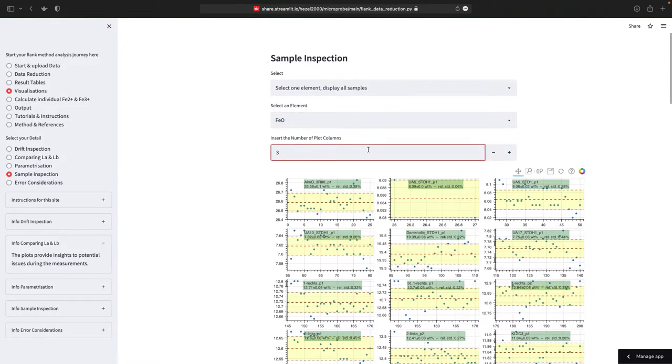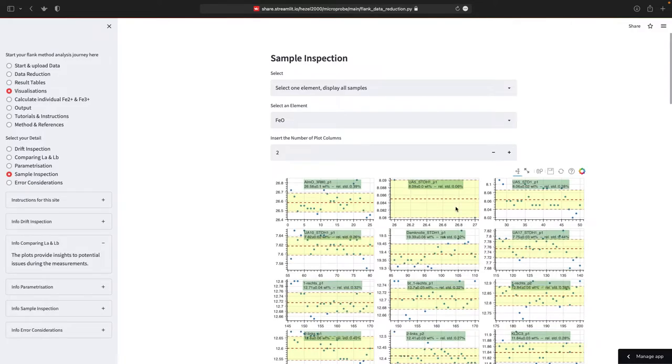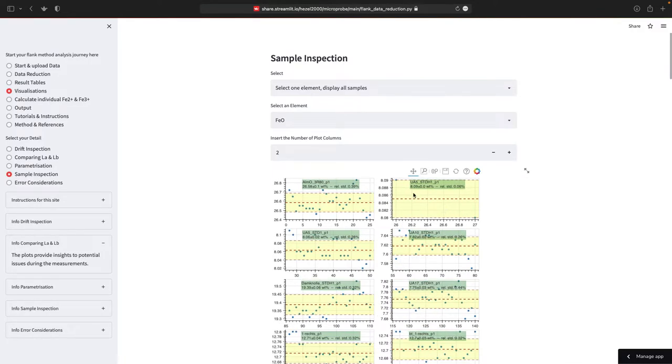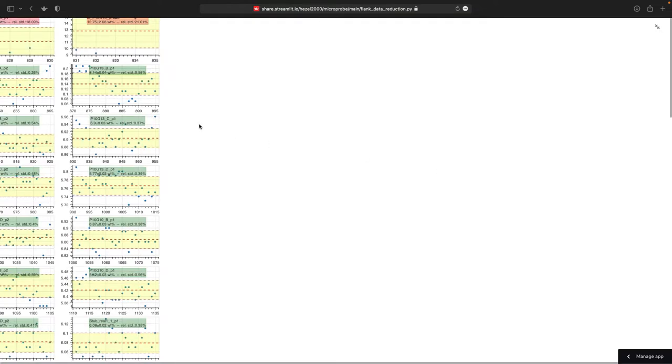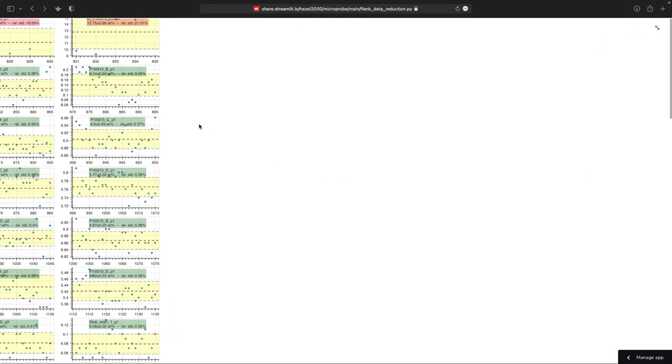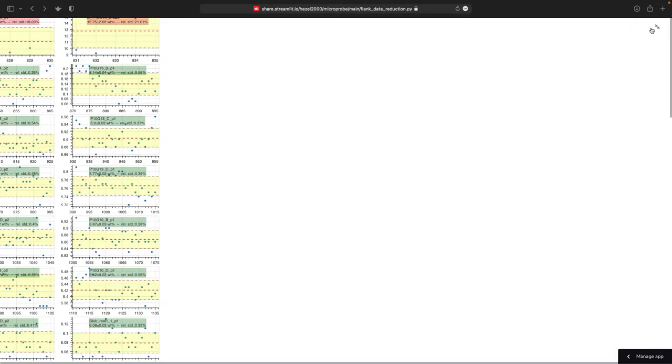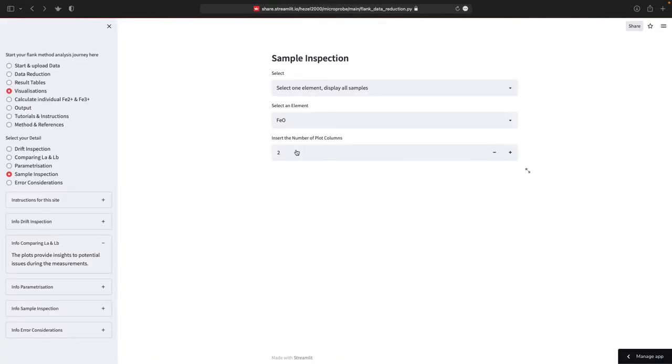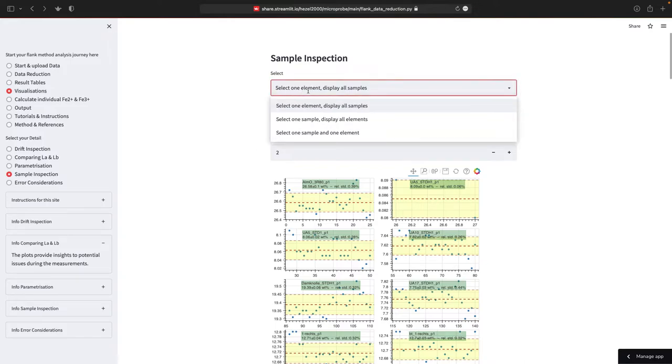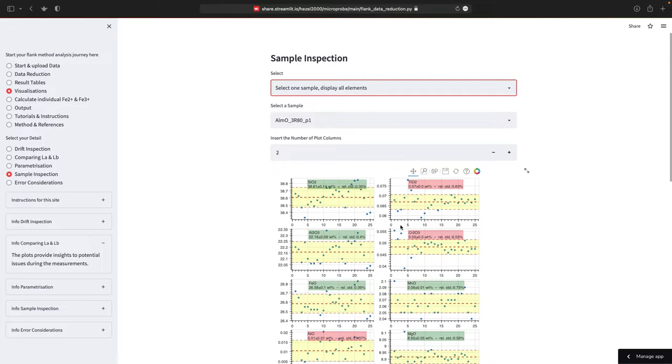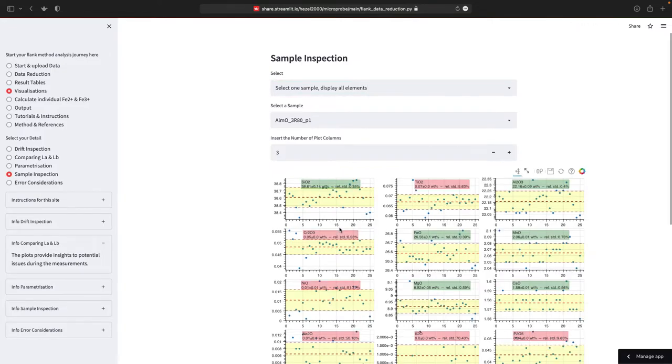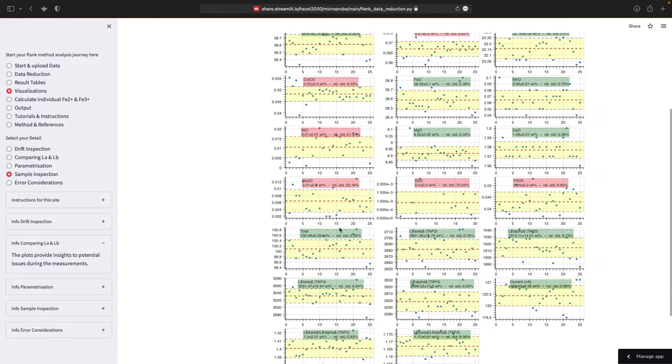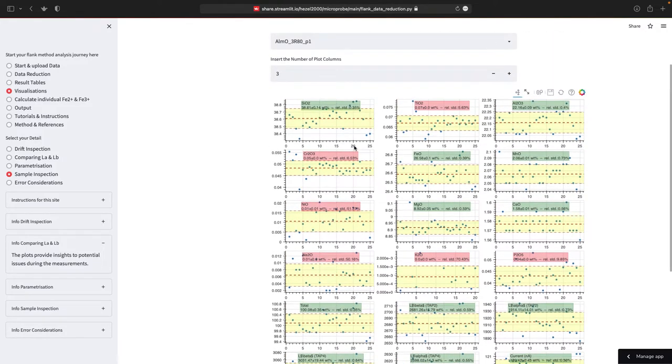And if you want only two columns, if on a smaller screen, then you can have also two columns. And again, this can be resized. So now everything is on one page and so on. Then there's the possibility to select only one sample and get all the elements. Again, you can increase the number of columns here.